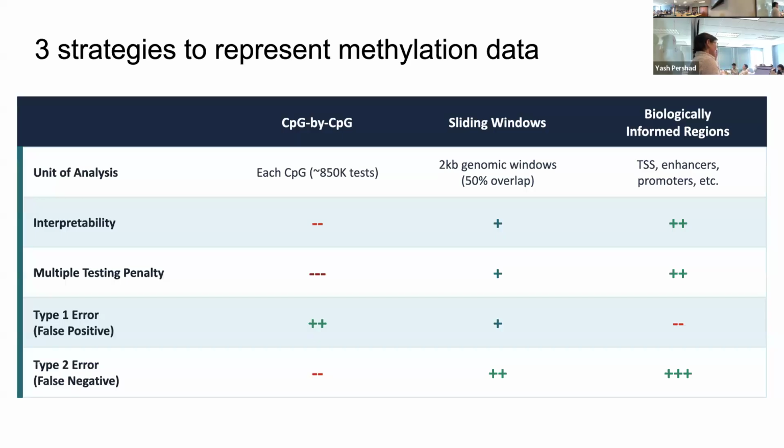There's also the consideration that, for sequencing-based technology, it's always good and really powerful to keep in mind that because we have the number of reads, this is such an advantage over, in my opinion, the EPIC platform. If you're trying to aggregate methylation, you combine all of those reads, which gives you a lot more power. It's very different to say these 10 CPG sites, some might have a coverage of 5 reads, and the next one might have a coverage of 50 reads. That's different information.